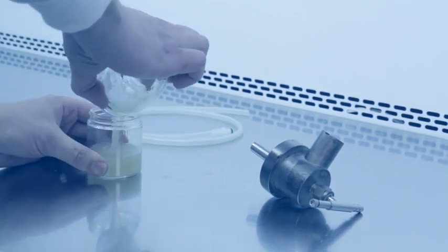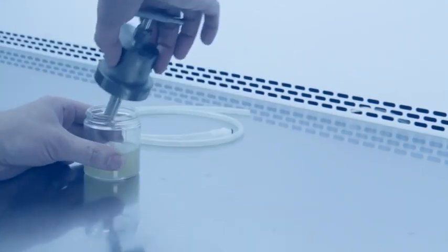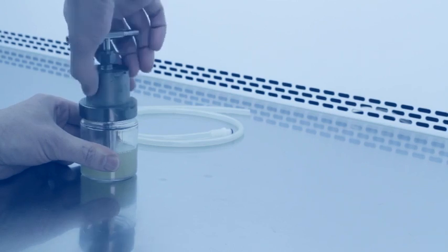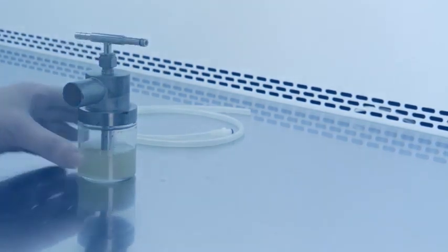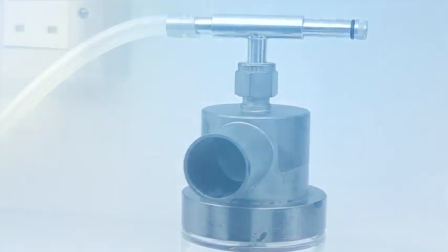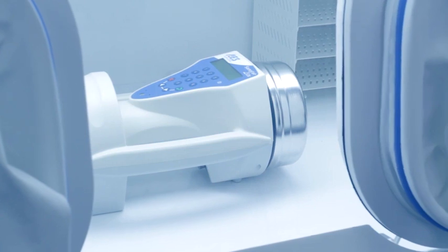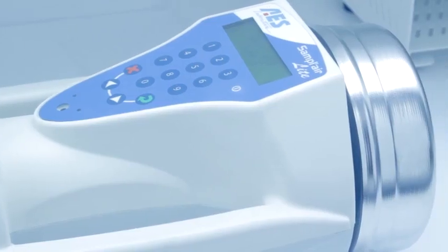We used non-spore-forming and spore-forming bacteria, which were prepared as dense suspensions and aerosolized into the internal atmosphere of each workstation using a nebulizer. Bacteria remaining within the atmosphere were then collected at intervals using an air sampler.